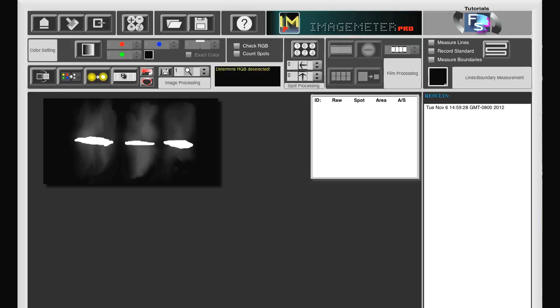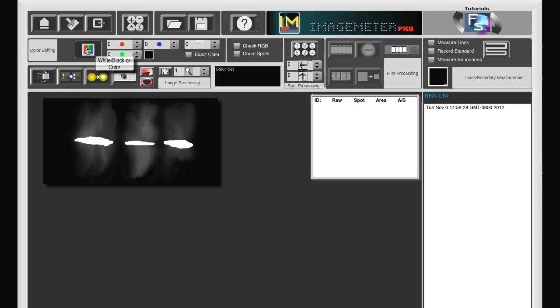To get more precise values, we may want to get rid of any background. So, for this, we use color setting. We press the color set button and now we have access to steppers for red, green and blue.